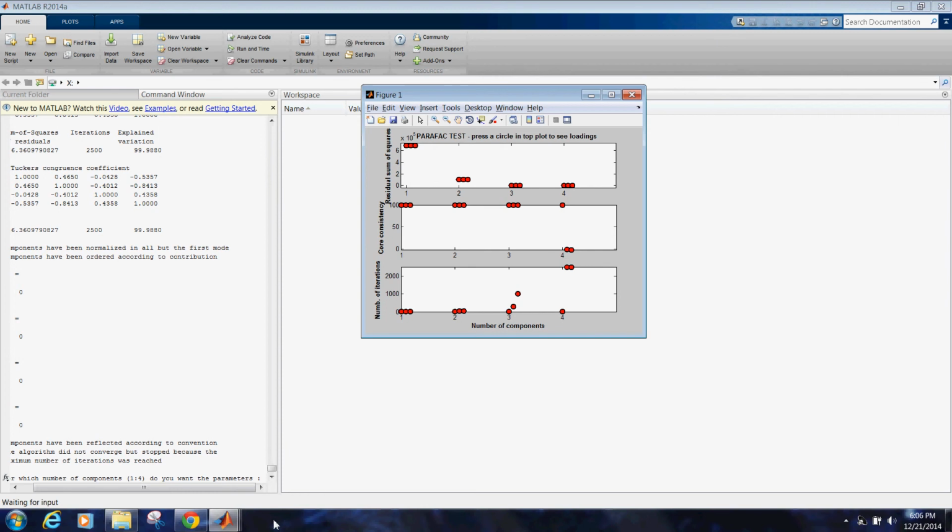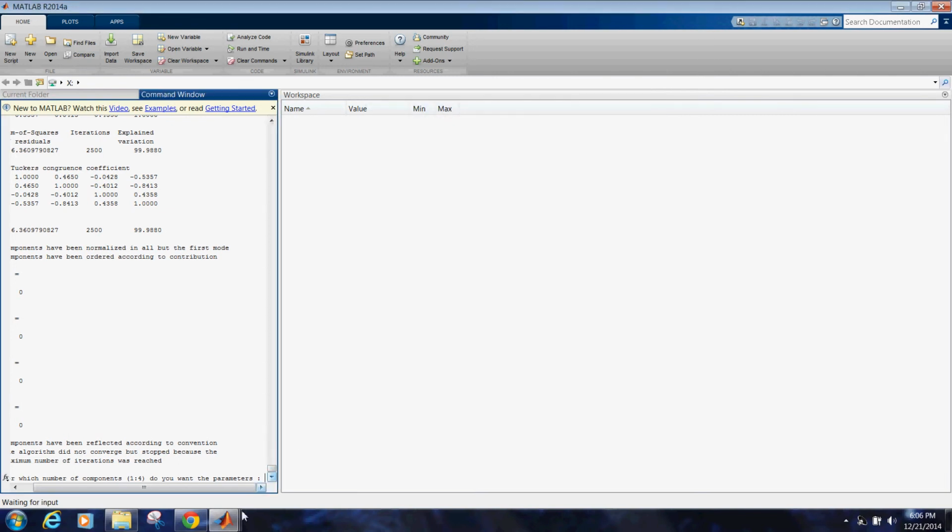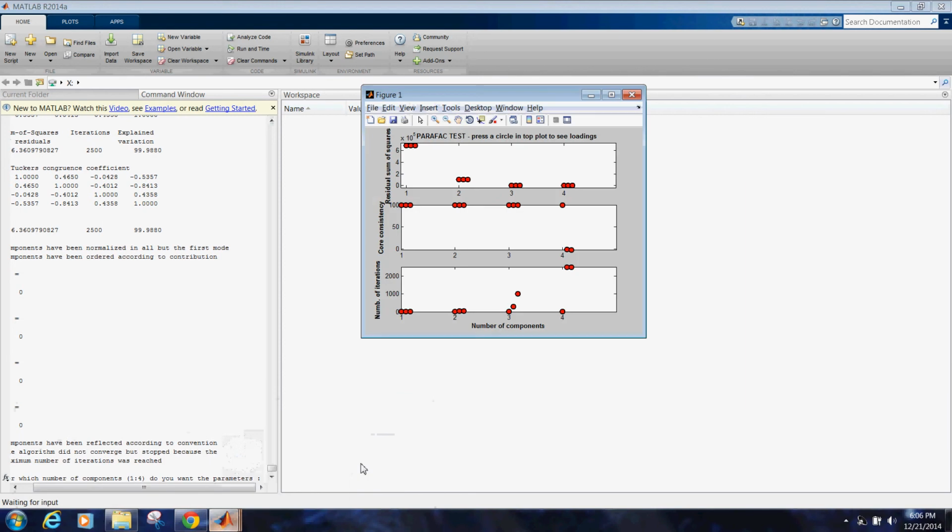In the last video, we showed how to run the PARAFAC model from the GUI environment, and we've got some results for the block that we produce. We've got our PARAFAC results. Now, what do we do with these? How do we handle them? Again, I had said that what it all means probably requires some study on your own, but what I can show you is kind of how to handle this.